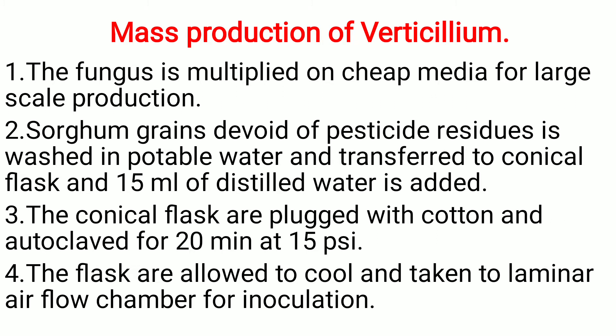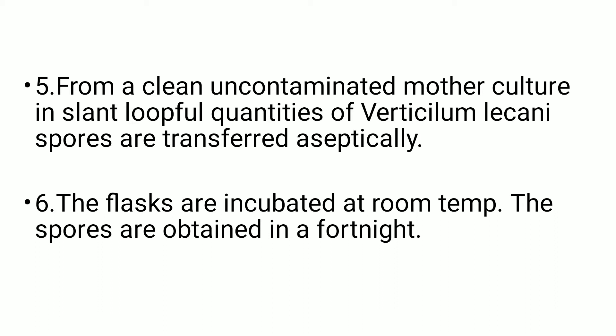The function of the autoclave is sterilization, so the sorghum grains become microorganism-free. After autoclaving, the flasks are allowed to cool and taken into the laminar airflow chamber for inoculation. Inoculation means transferring from a clean uncontaminated mother culture on slant — the fungus already grown in a test tube containing media. This is called the mother culture of Verticillium on slant.